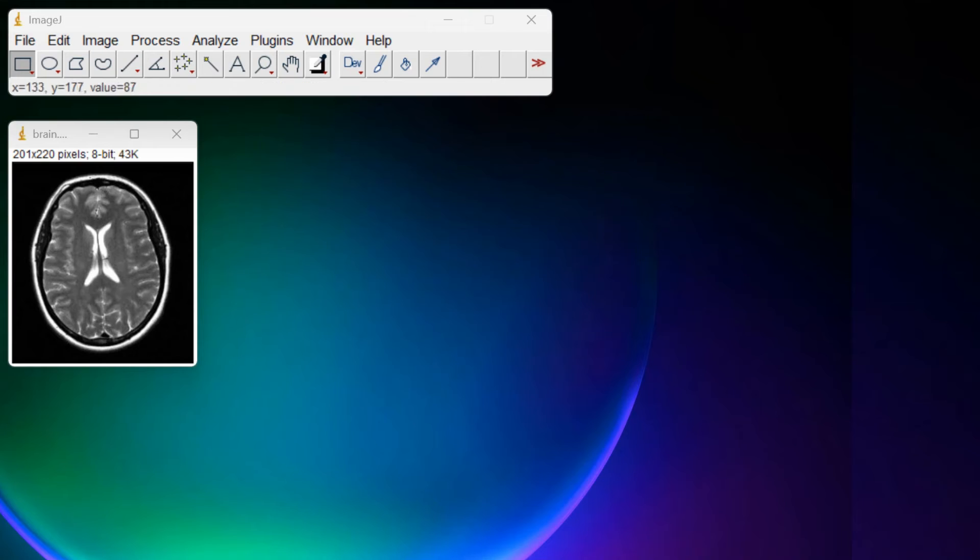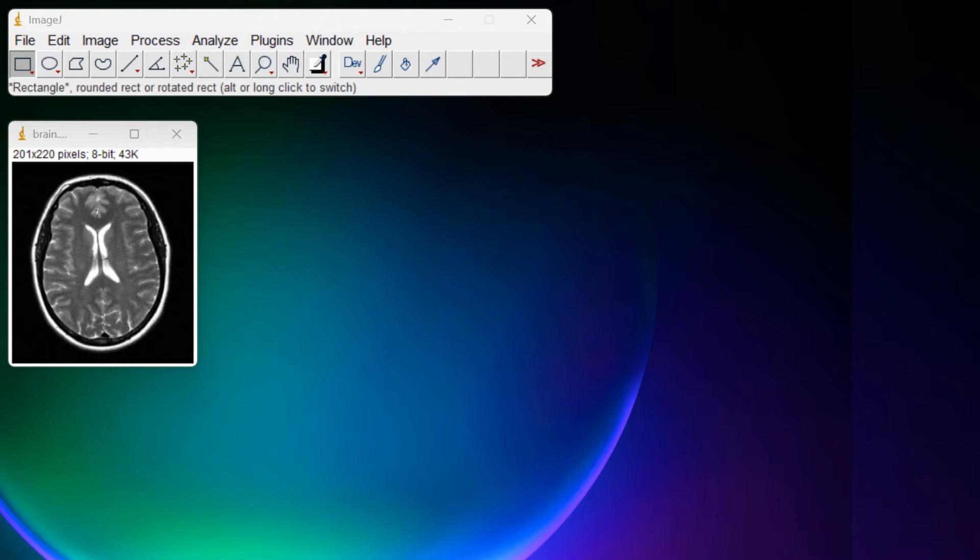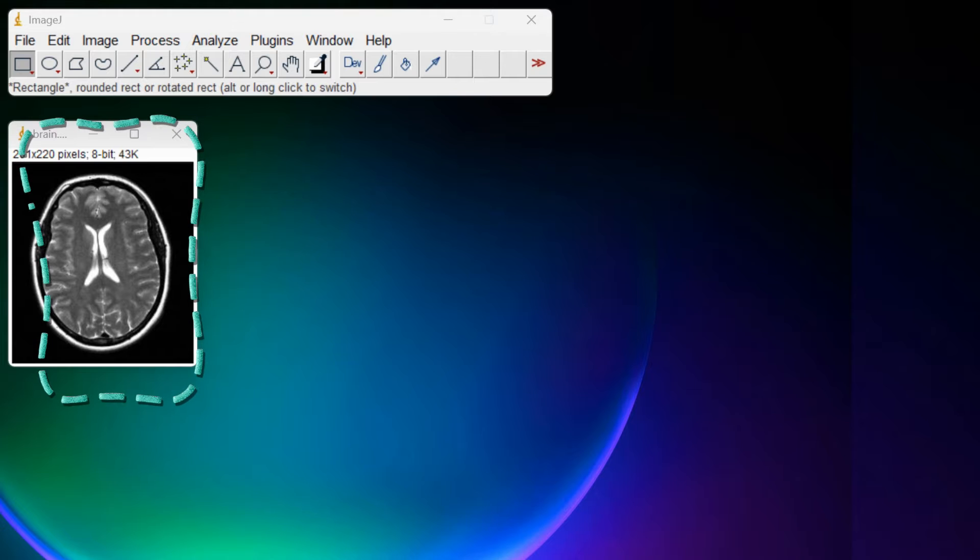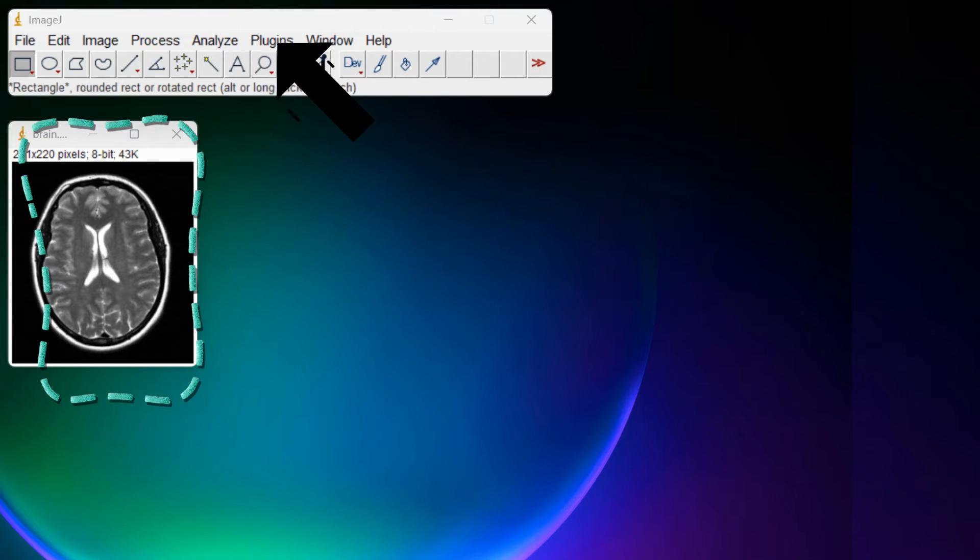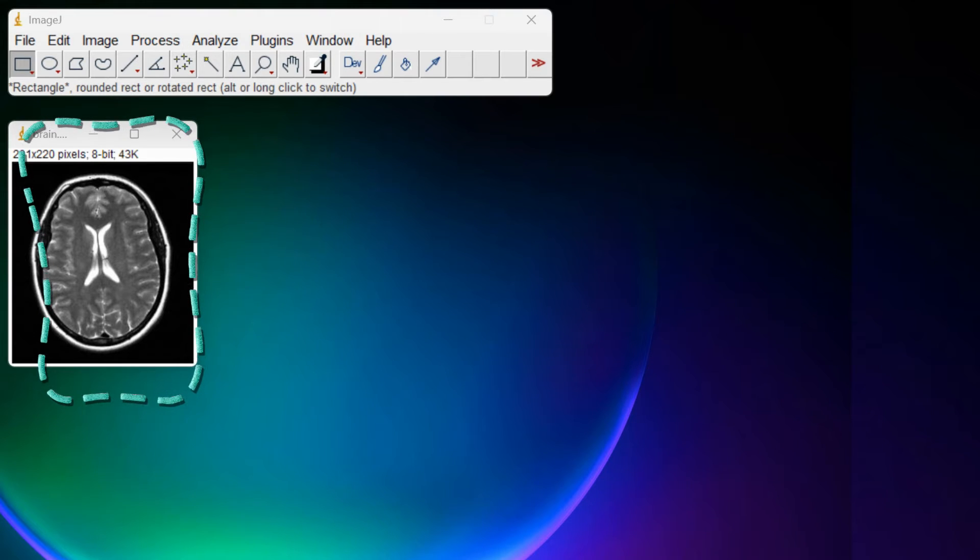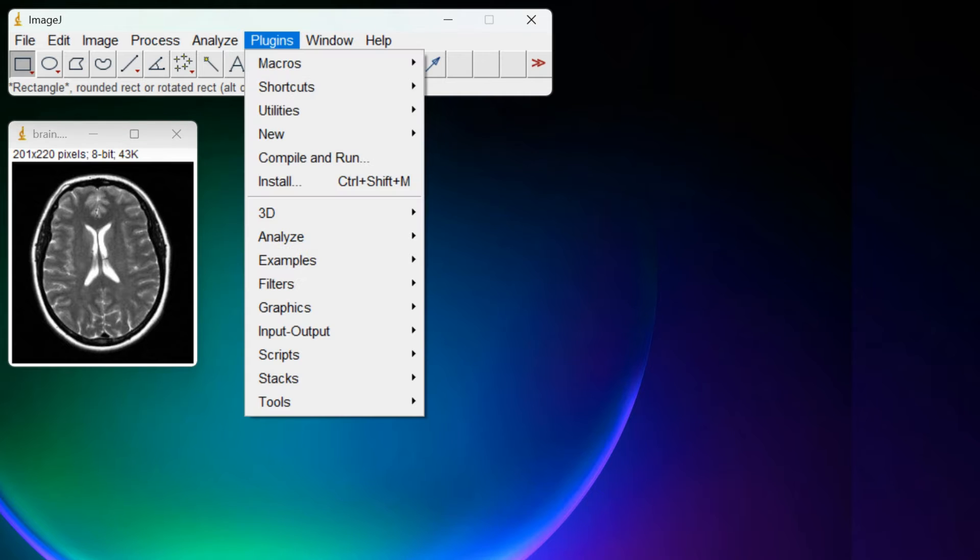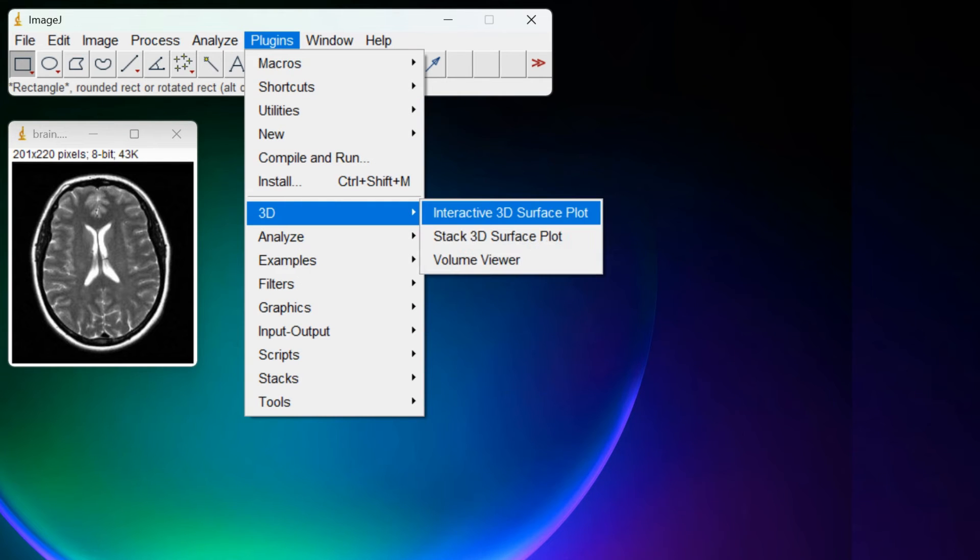Do you know ImageJ allows us to visualize images as a 3D plot? After loading your image, go to Plugins, 3D, and then Interactive 3D surface plots.